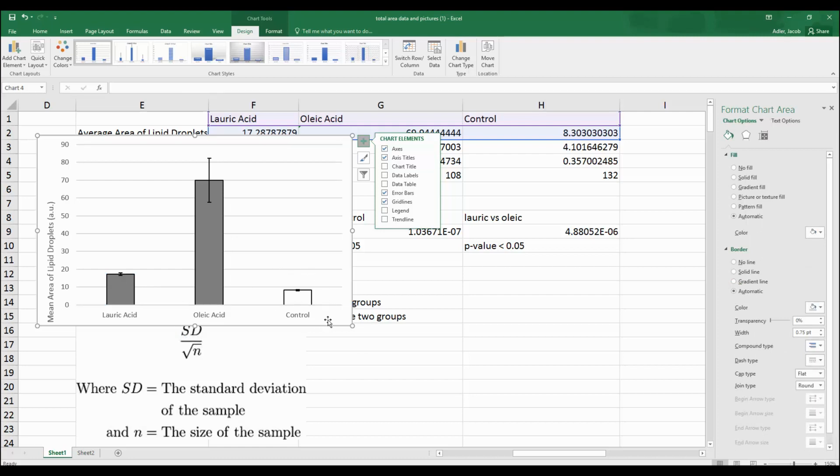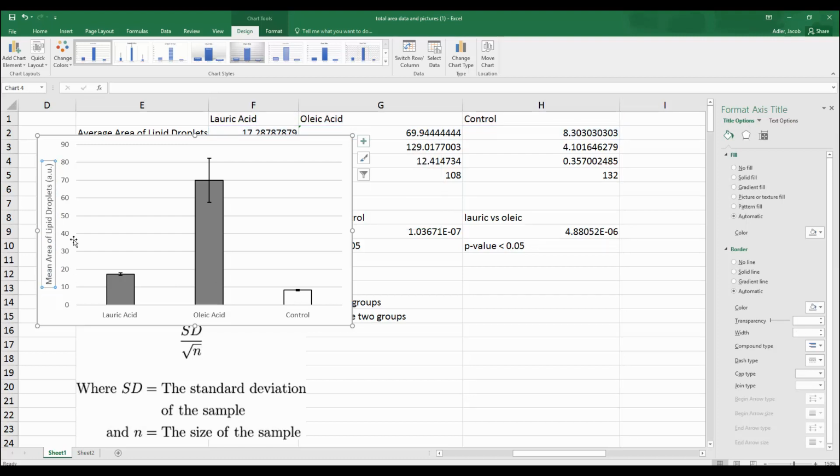And so I kind of like this, but once again, you can do whatever colors fit your color scheme for your website, probably to be best. But this is what I would call a finished product. If it was me, I'd probably change the font a little bit and the color of the font to match whatever color scheme is going on in my website. But this is essentially what you need.